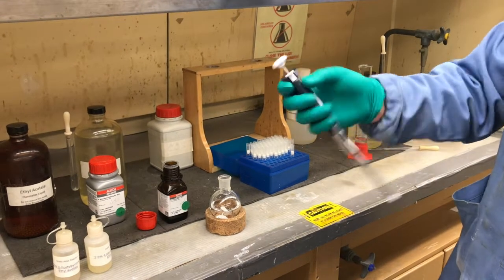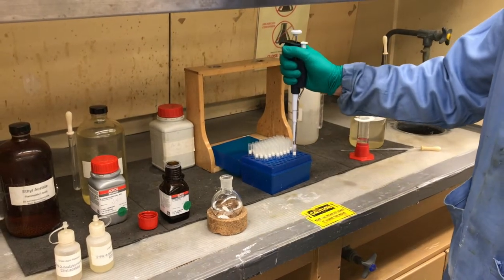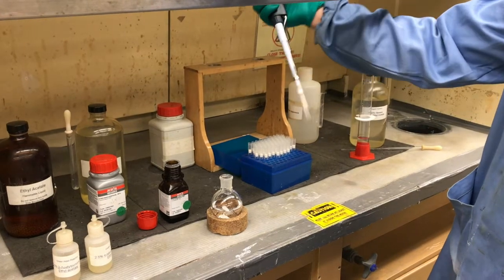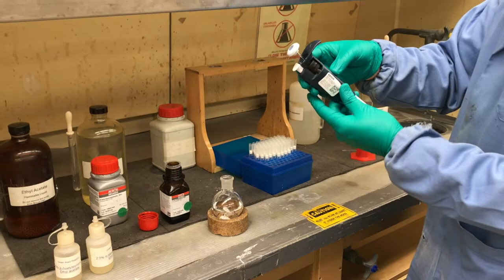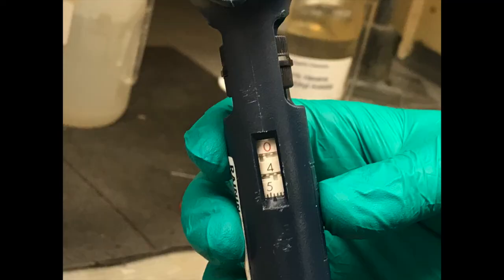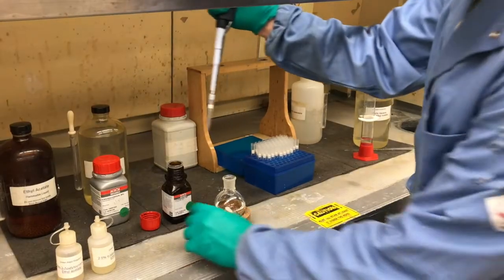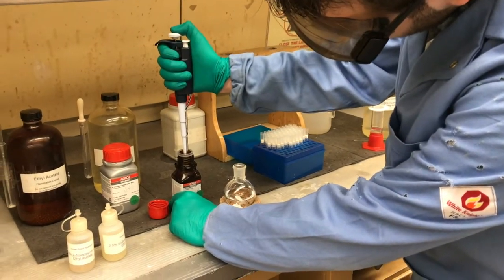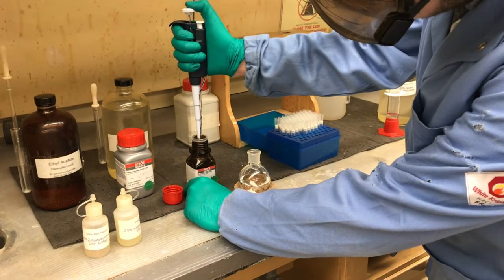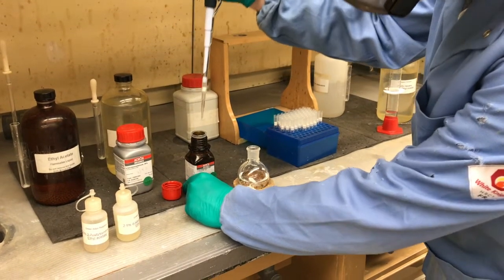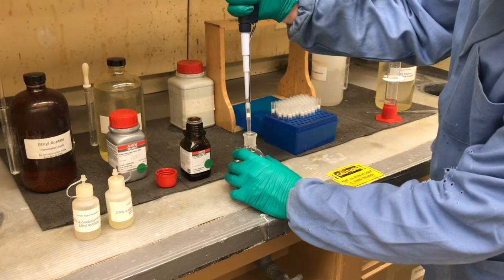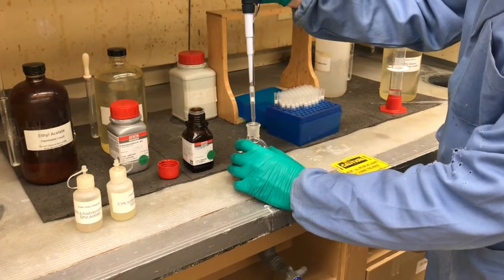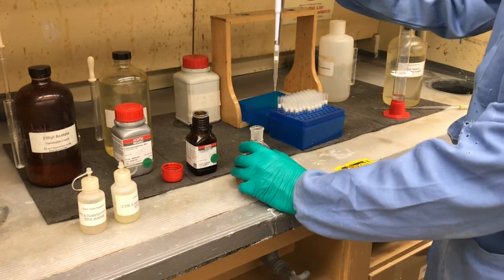So what you have to do is take your pipetter, press it down onto the tip. It's attached, and we already set it to the 0.448 ml that we needed. All we have to do is bring it down into the solution, press it down, bring it up, take it over, and then press down. And now we've added our 2-acetylpyridine.